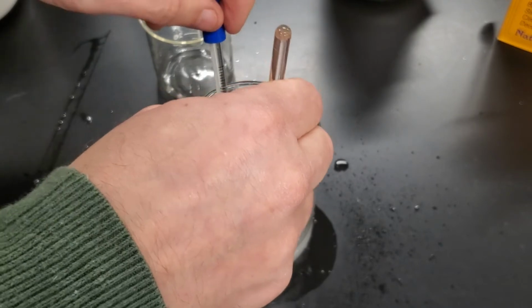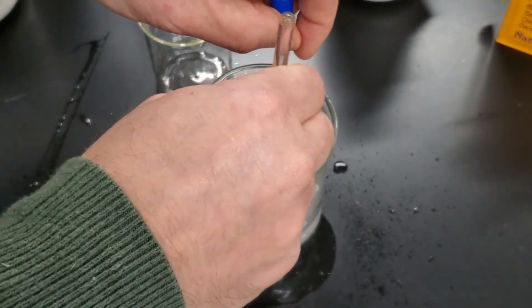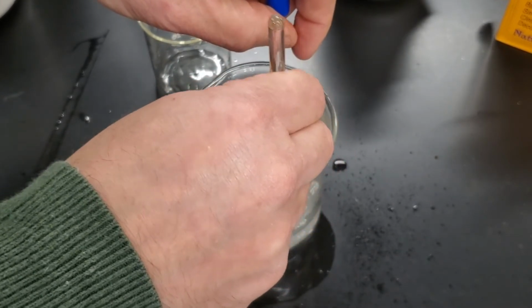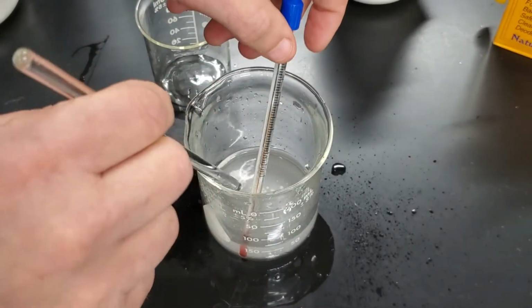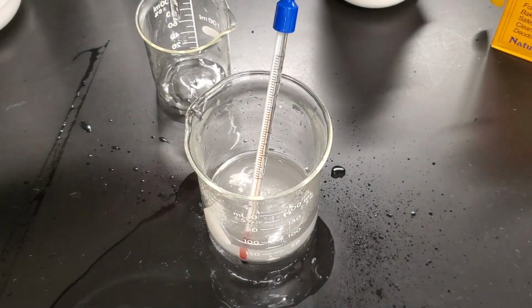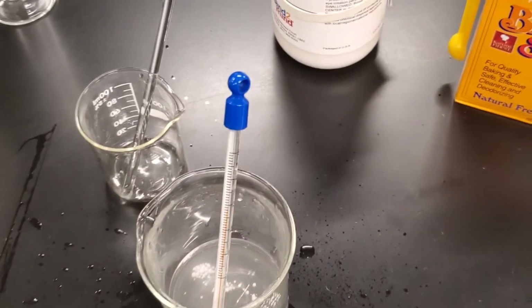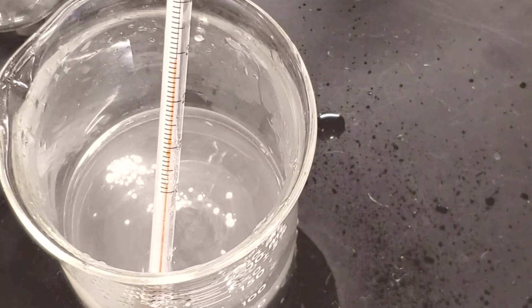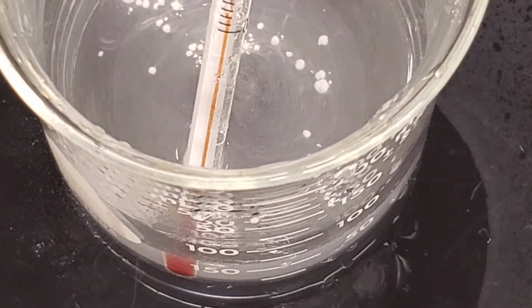So I'm going to go ahead and put the thermometer in there as I continue to crush this up. That way we can start our timer for 2 minutes. So the rest of that should dissolve and keep that temperature where it needs to be. So we'll once again look for any observations while we're doing the 2-minute wait. It does appear that the liquid is mostly clear.